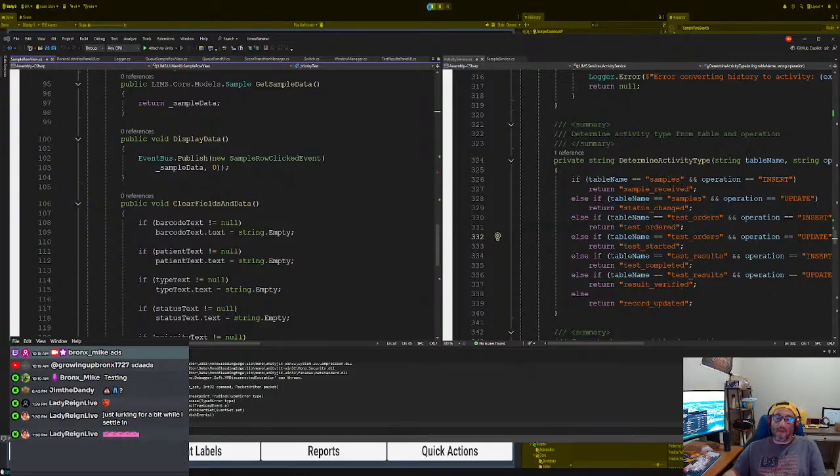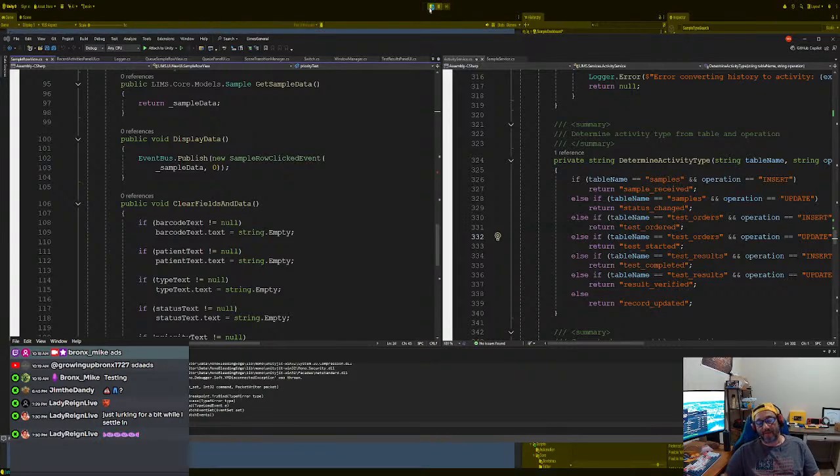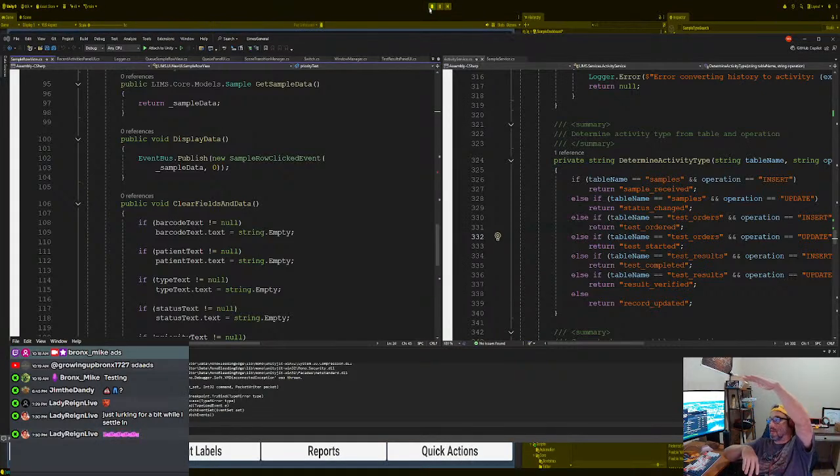If you want to, you could set that setting in the database. You have a table called settings, and it'll do all that for you. So that looks good. That looks better, yeah. This looks much better. And then we also have a setting on here that says the spacing in between rows, with row height of 50. Then the pending toggle, okay, we've got to fix it.